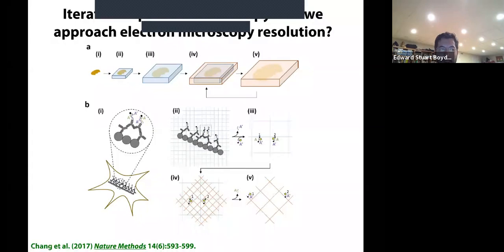So I've now told you that we can image proteins and RNAs throughout brain circuits with nanoscale precision and on regular microscopes. But everything I've showed you so far is expanding by only about 4-fold. Can we expand bigger? Well, when J.B. Chang was a postdoc in our group, we developed a protocol to take a piece of brain, polymerize and expand it, then form a second polymer in the space opened up by the first expansion and expand it again. We call this iterative expansion. If you expand fourfold two times in a row, the final expansion is 4 times 4, or 16. This could give you extremely fine resolution because now your microscope will have 16 times better performance.